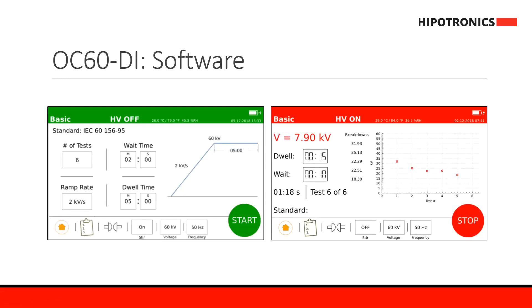Here you can see the screens of the OC60 DI software. On the left side you can see the values set for the test. You can upload preloaded national or international test standards by clicking on the clipboard at the bottom, then choose the standard you're testing to. If the standard is not preloaded, you can click on each value on the screen and fill them in as necessary. Once values are uploaded, press start and the screen will switch to red to show that high voltage is on. As each test finalizes, the breakdown values will appear on the graph on the right side, and once done, all values are automatically calculated and can be exported via USB or printed.